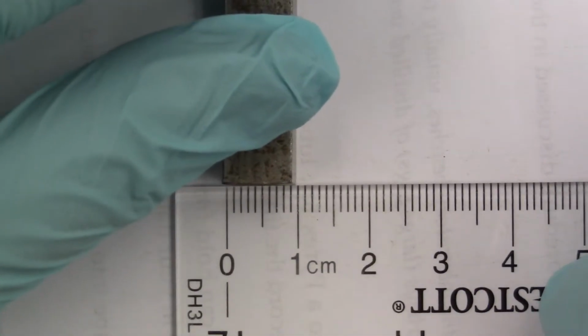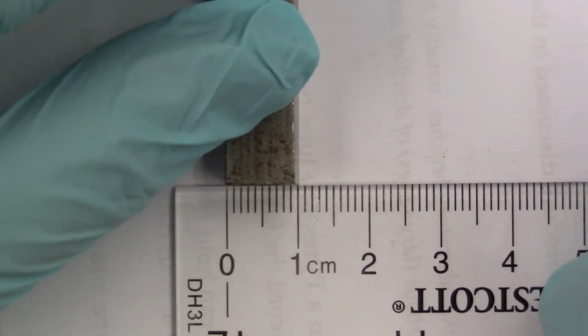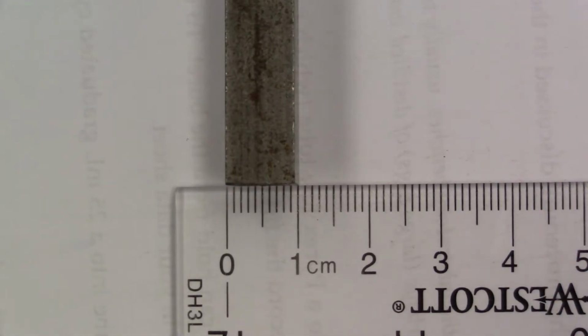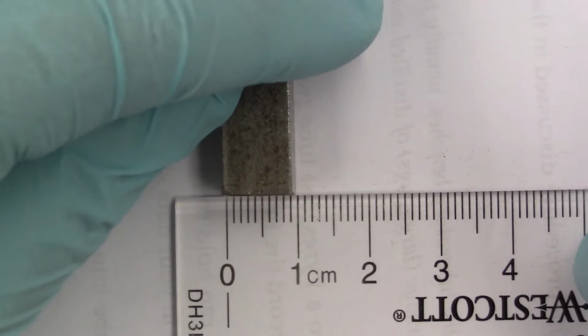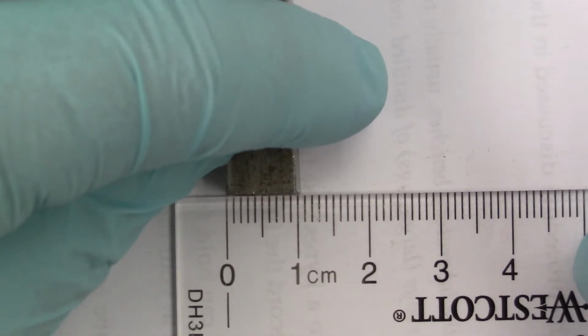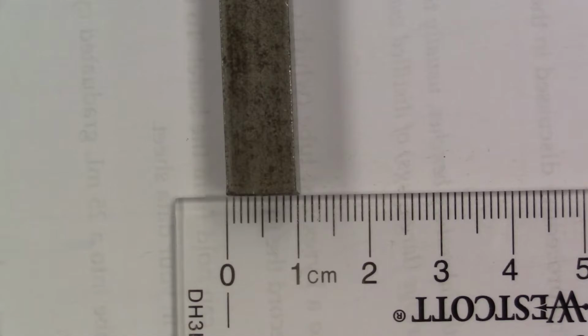Let's push it around this way now. Let's see if we can get the width. So this would be the width. I think that's fairly simple to read right now. And we'll just flip it over to get the height. A little bit more. There we go. And there's the height. Go ahead and read these measurements off yourself. Write them in the data sheet in your workbook and calculate the volume.